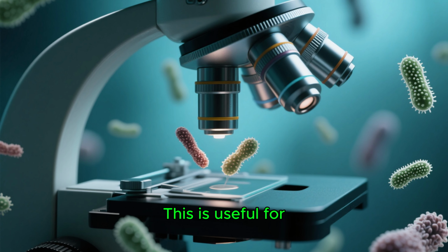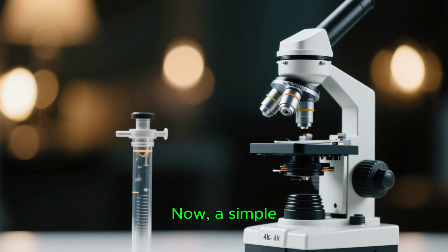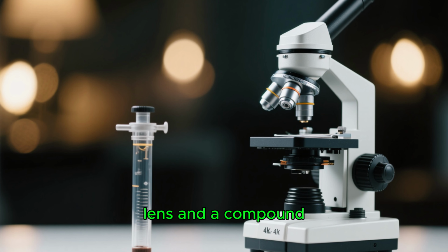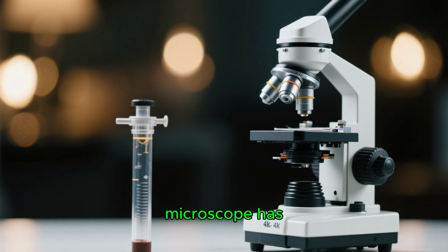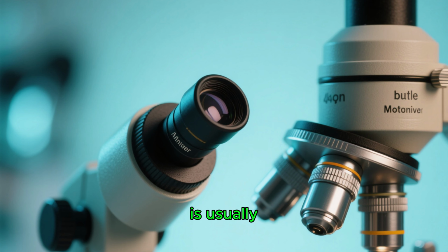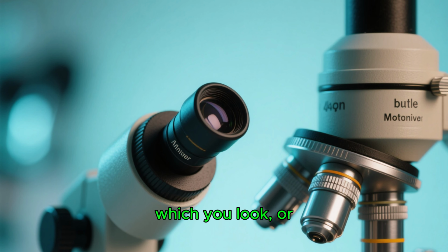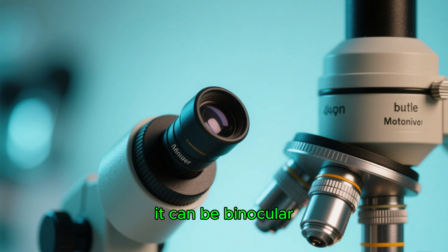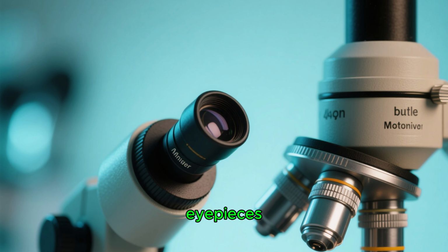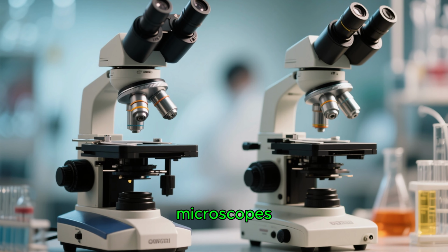This is useful for seeing things like bacteria or fungi. Now, a simple microscope has one lens and a compound microscope has multiple lenses. Remember, a compound microscope is usually monocular, meaning it has only one eyepiece through which you look, or it can be binocular, meaning it has two eyepieces. And both of these examples are compound light microscopes.